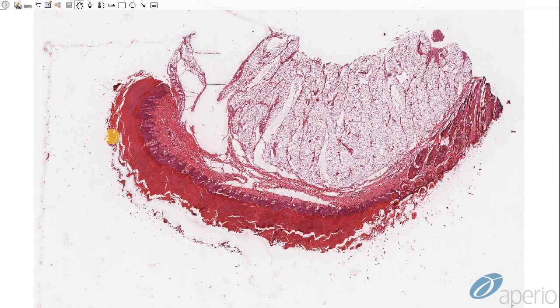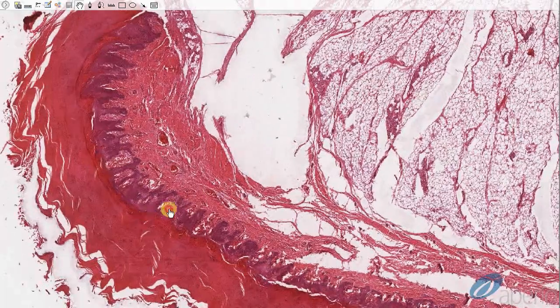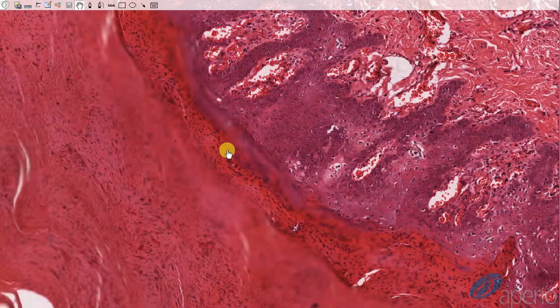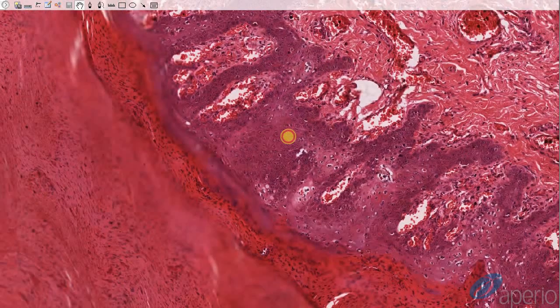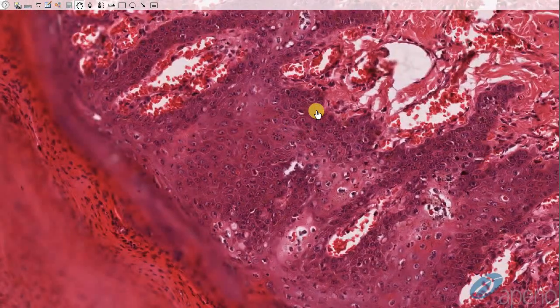At low magnification, we see that diffusely affecting the footpad is a marked area of hyperkeratosis. At higher magnification, we can see that the hyperkeratosis is the parakeratotic type, meaning the keratin layer contains retained nuclei. This is as opposed to orthokeratotic hyperkeratosis, in which the keratin layer does not contain nuclei. The epidermis is acanthotic, meaning it is proliferative.